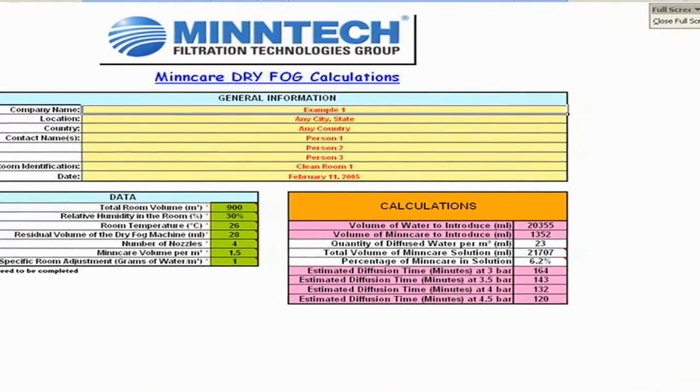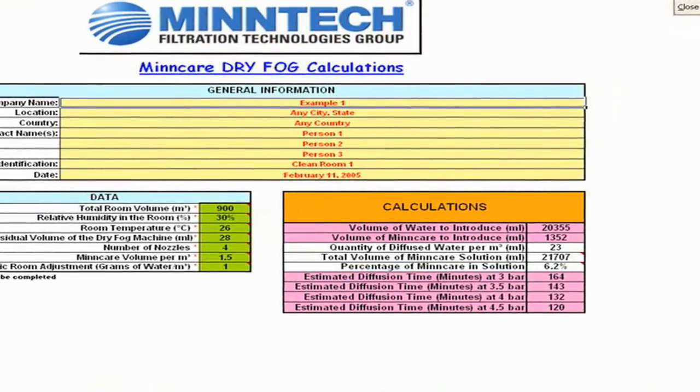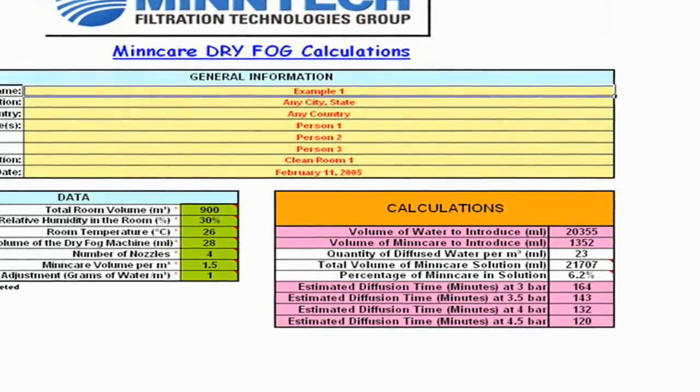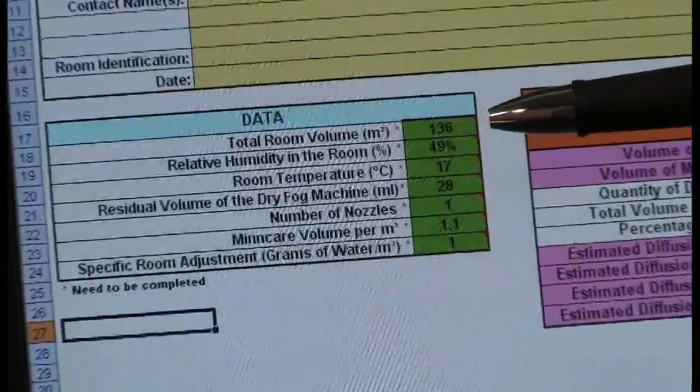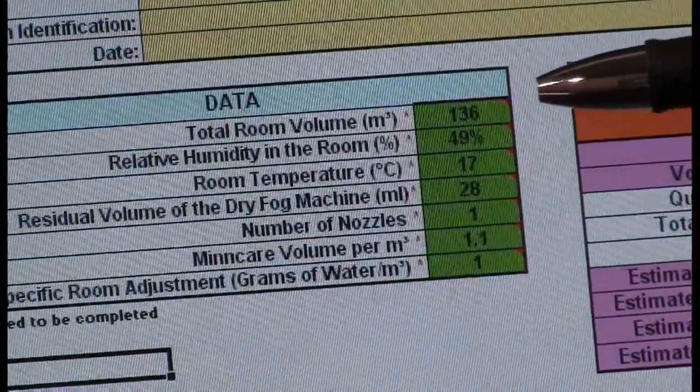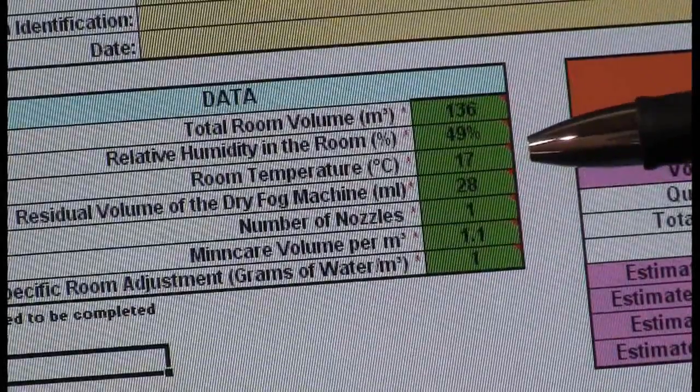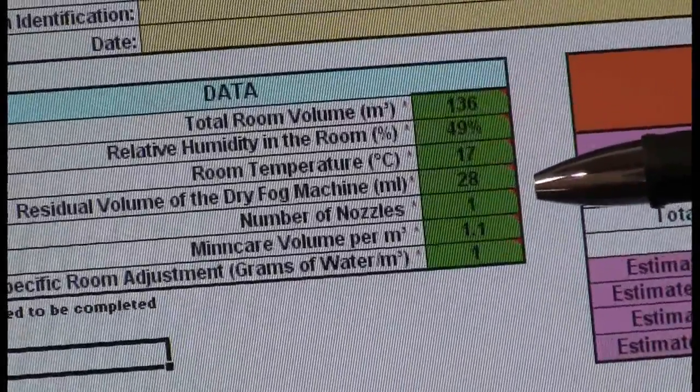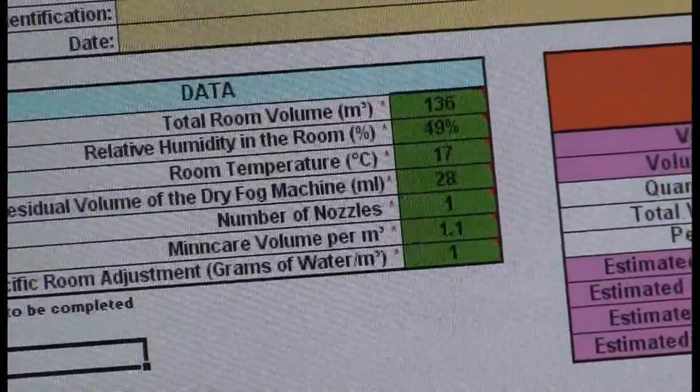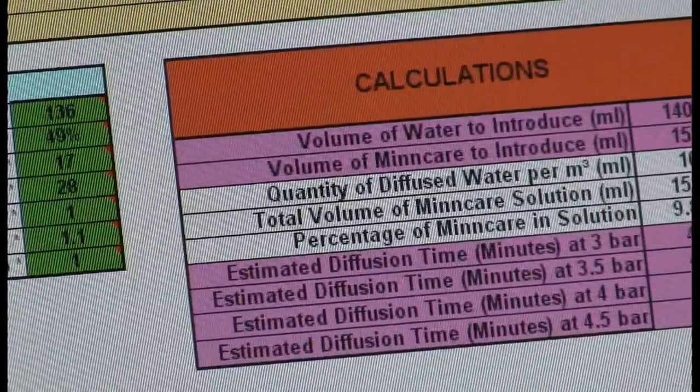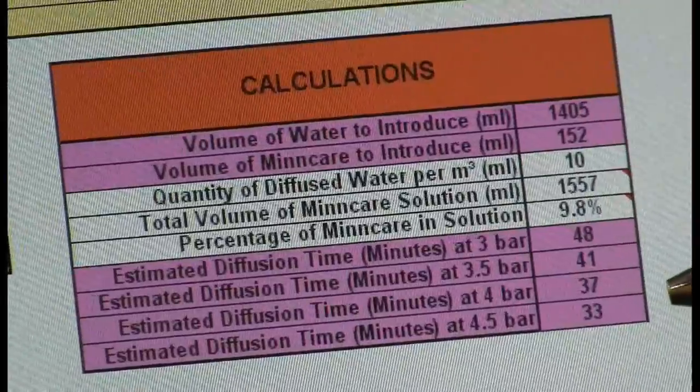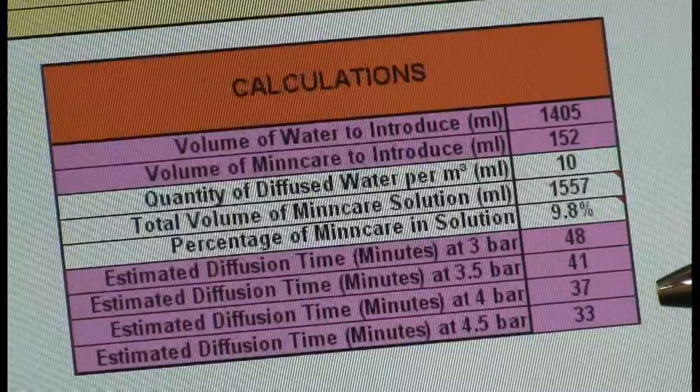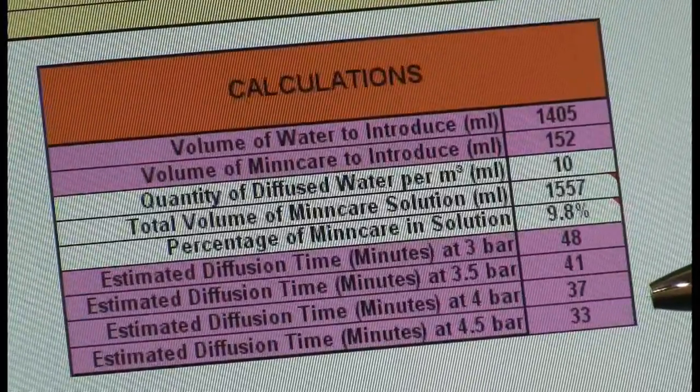With this simple Excel based program that we supply, everything is done for you with the exception of putting in the inputs. So what we calculate here: total room volume in cubic meters or cubic feet converted to cubic meters, relative humidity and temperature at the time of fogging. Input your number of nozzles right here and that will tell you exactly how much water to introduce, how much MinCare to introduce, and at 4.5 bar, which is 65 PSI, it'll take you 33 minutes to completely disperse the dry fog into your clean room.